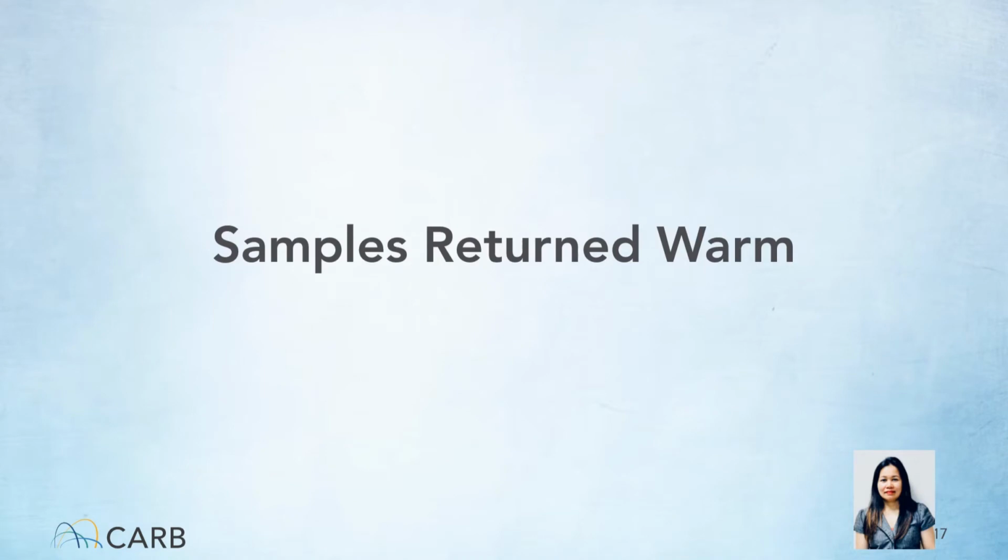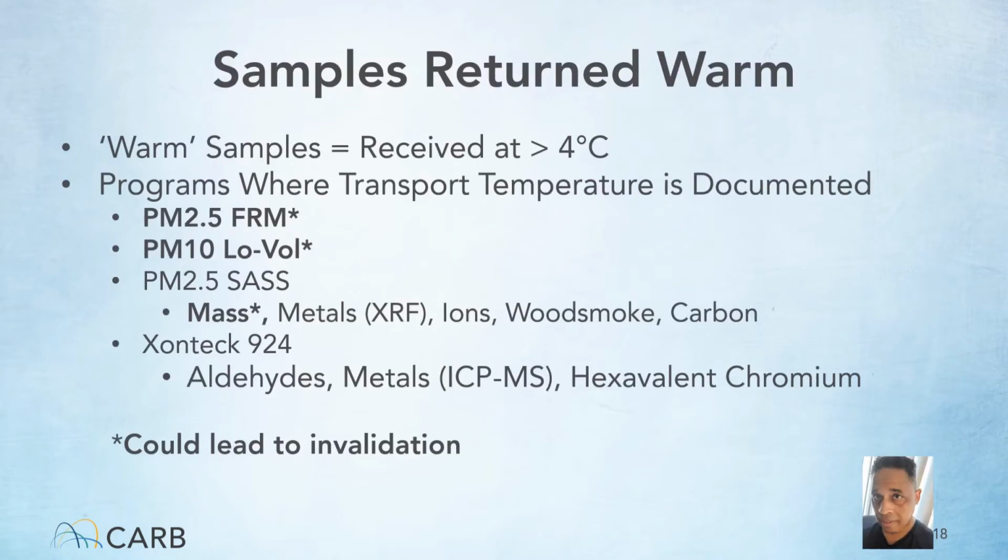Another challenge that I know both site operators and the CARB laboratory analysts are keenly aware of is samples arriving at the laboratory warm. Lloyd will discuss this in the next few slides. Thank you. Hello, I'm Lloyd Williams, the newest member of the sample handling team.